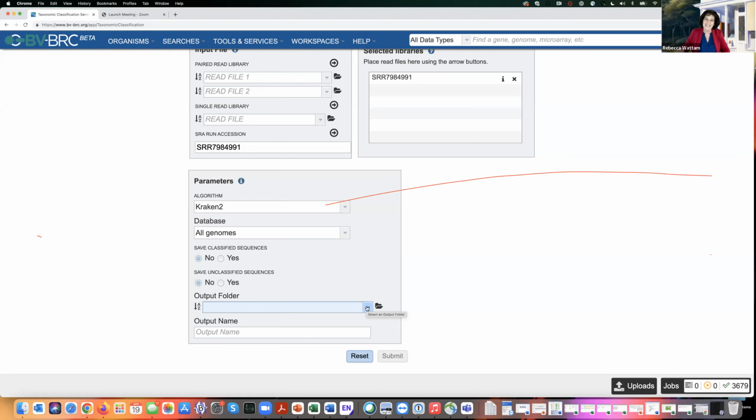We just had a discussion about this morning because we have a user who has a similar circumstance, and we've been running a script independently for him on occasion to combine those files to make it easier for him. Or you could use command line to do it. This is the user who's having this problem that cannot use command line.